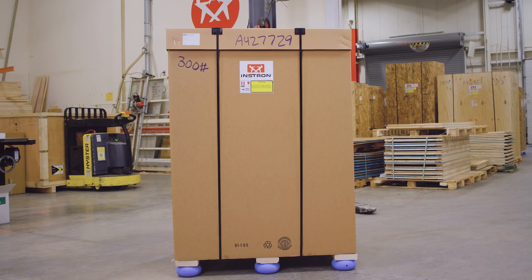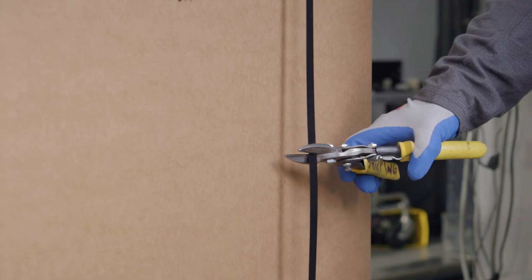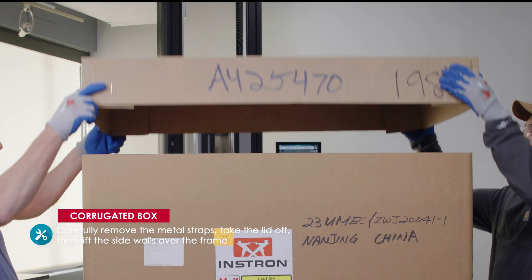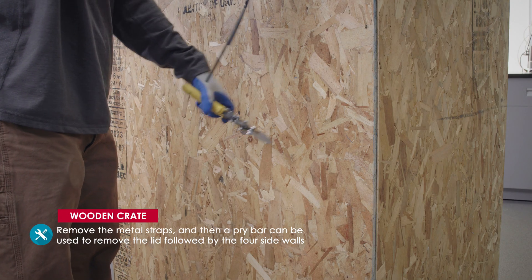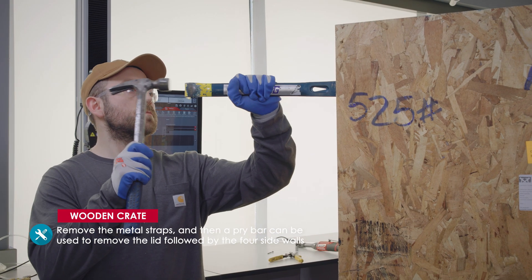Most systems will ship in either corrugated box packaging or a wooden crate. In the case of a corrugated box, you'll first want to carefully remove the metal straps, take the lid off, then lift the side walls over the frame. For wooden crates, remove the metal straps, and then a pry bar can be used to remove the lid, followed by the four side walls.